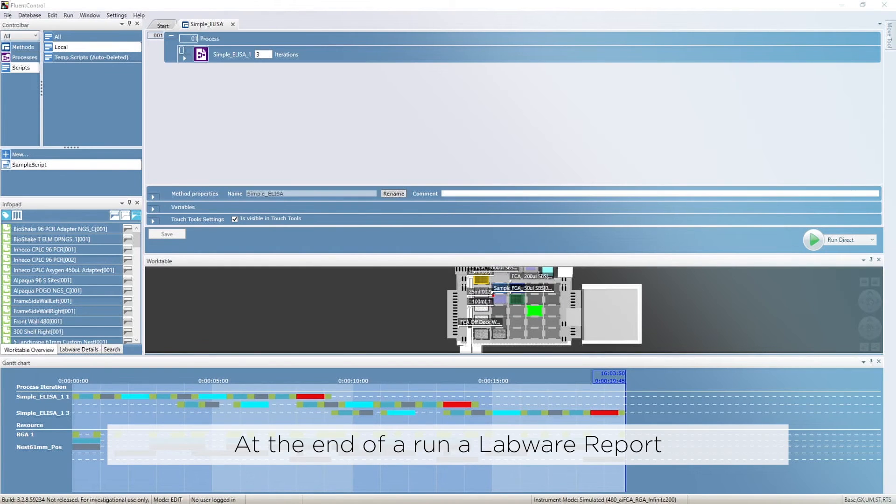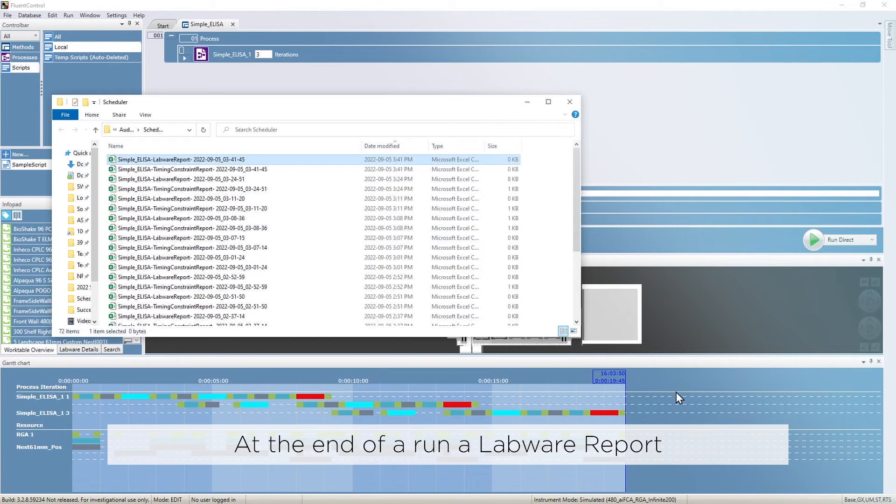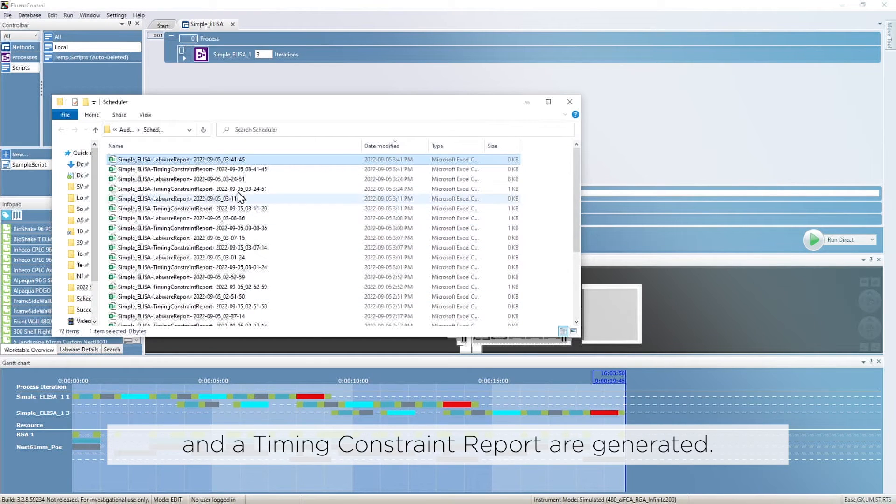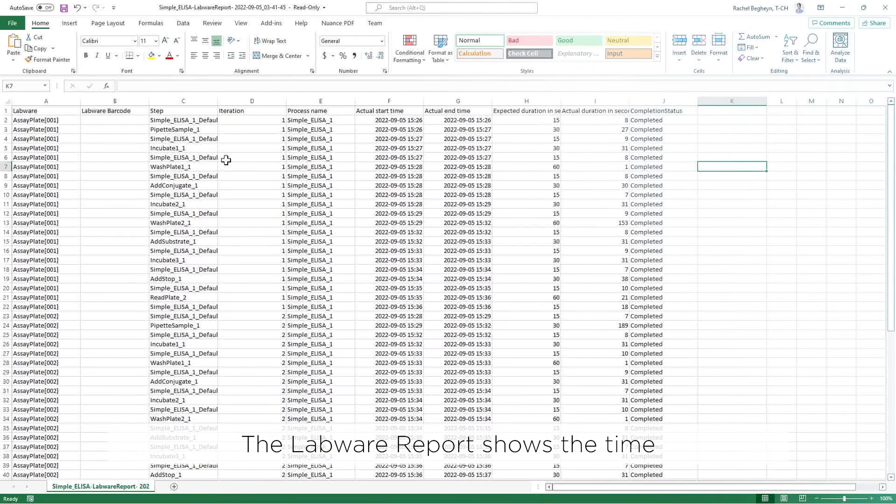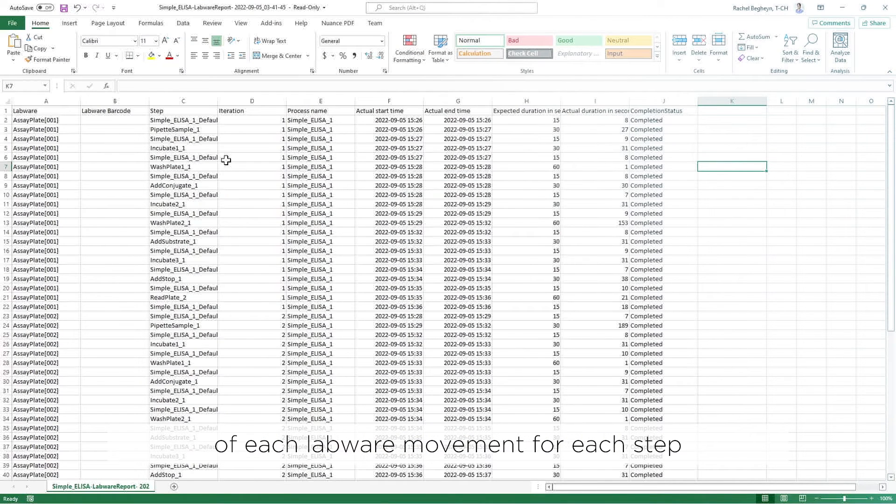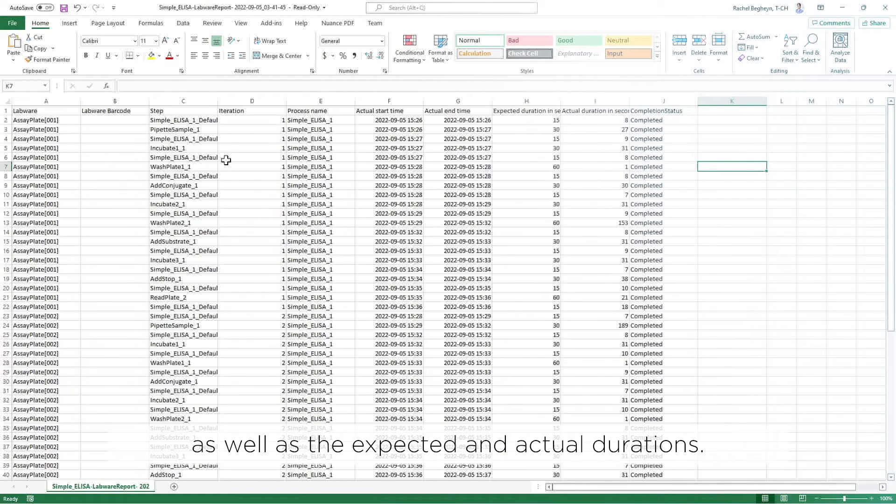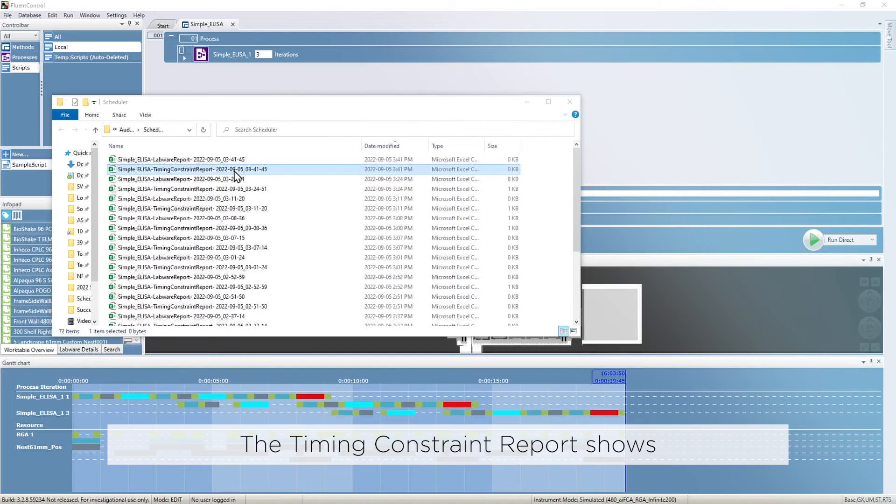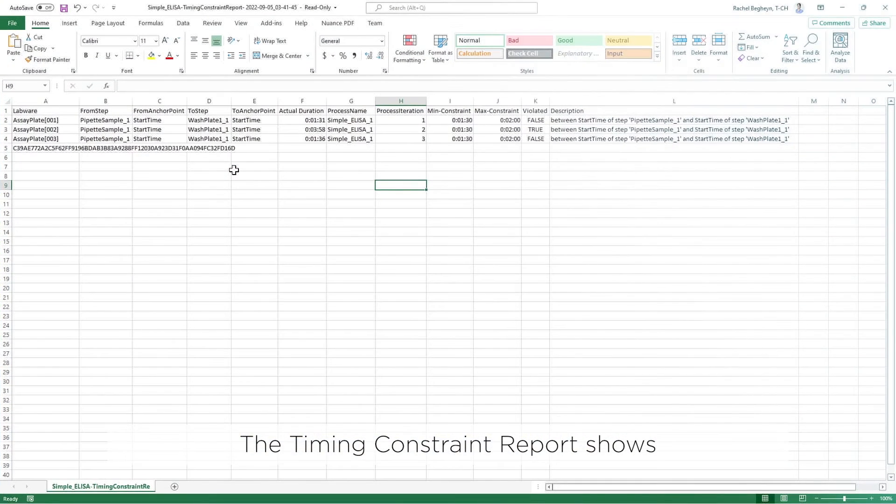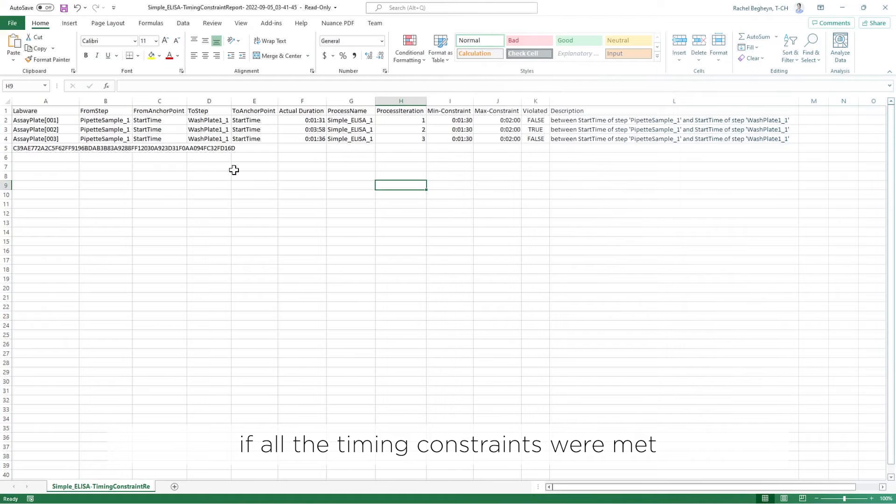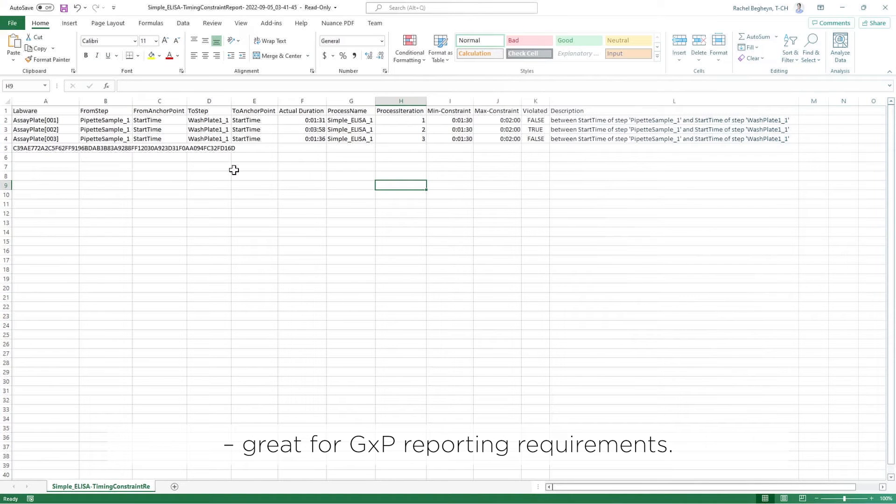At the end of a run, a labware report and a timing constraint report are generated. The labware report shows the time of each labware movement for each step, as well as the expected and actual durations. The timing constraint report shows if all the timing constraints were met. Great for GXP reporting requirements.